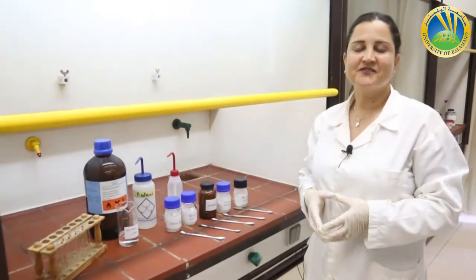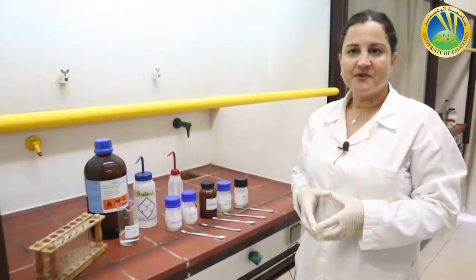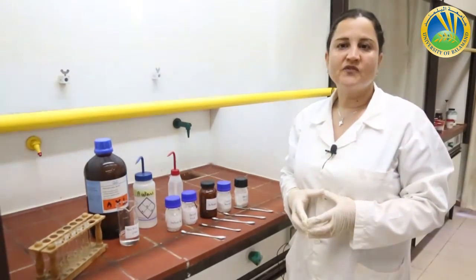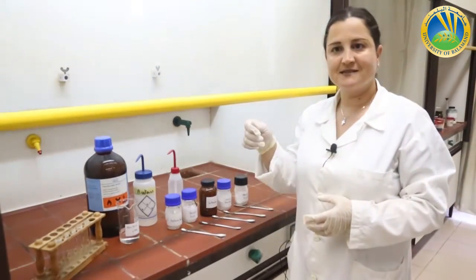Hi CHEM245 students. Today we are going to do our third experiment, which is the recrystallization. To choose the best and adequate solvent for recrystallization, we are going to do some tests.